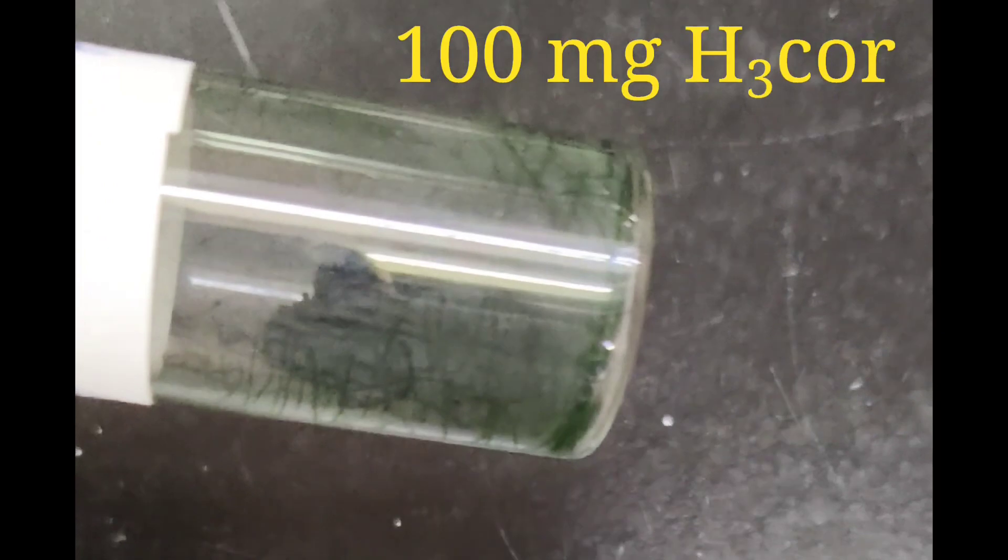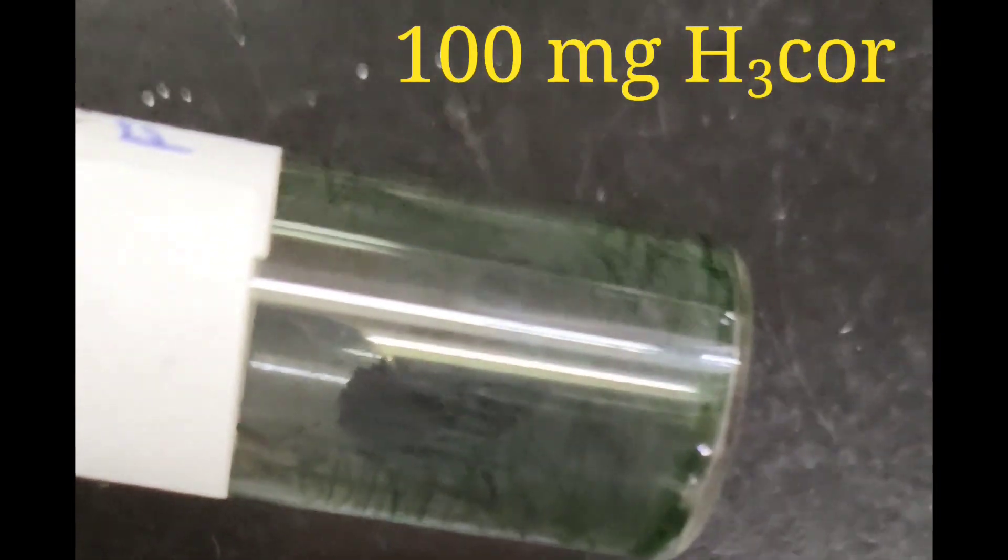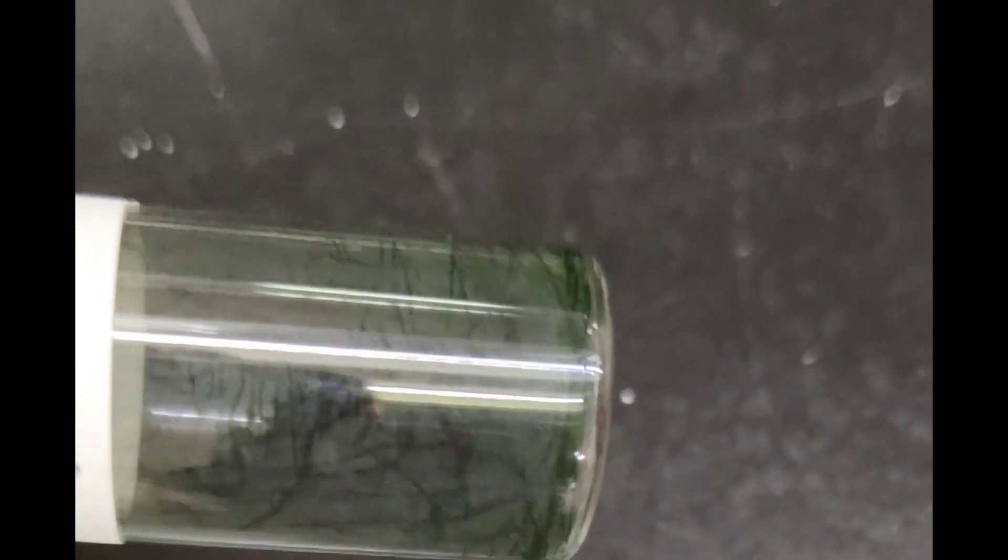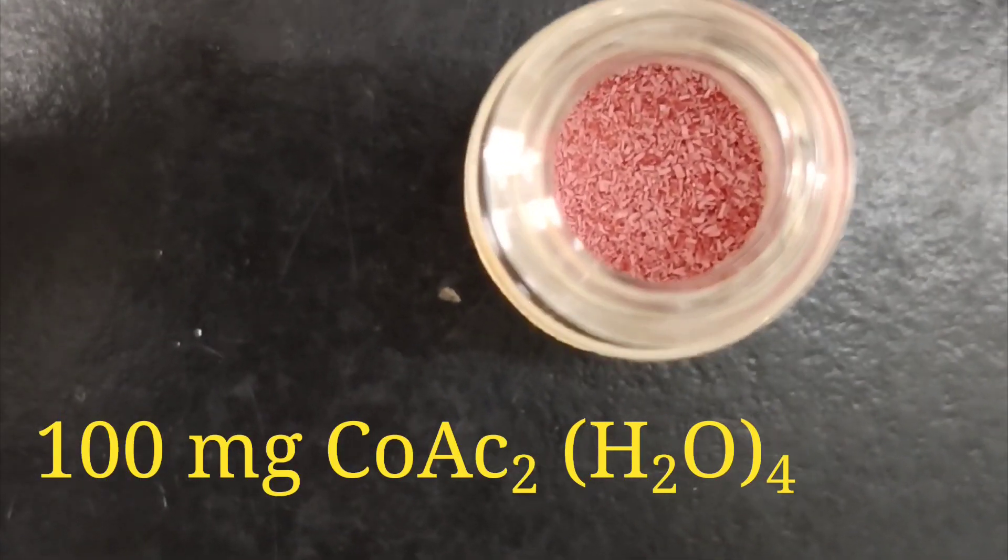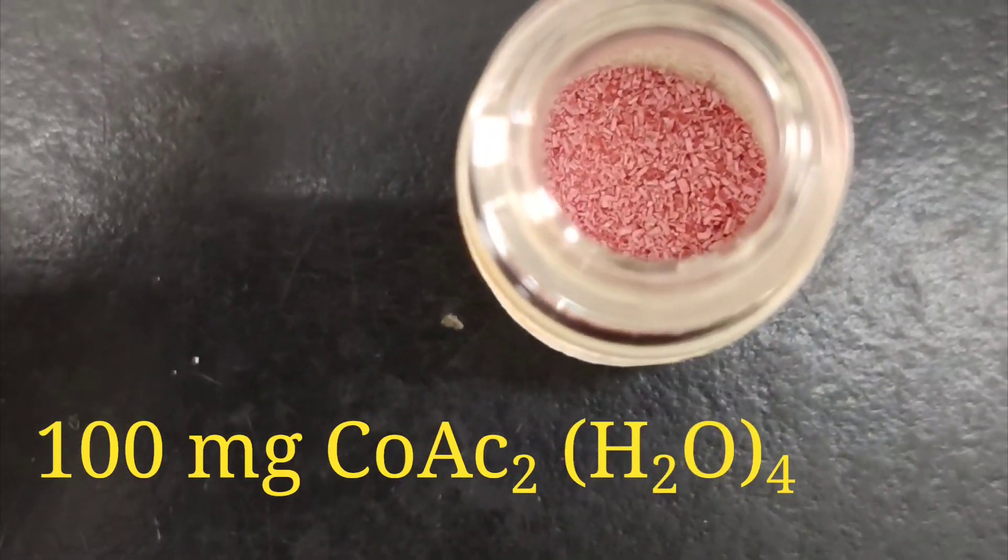First we weigh 100 milligrams of the freebase corrole which can be seen in this vial. We also weigh 100 milligrams of cobalt acetate tetrahydrate which is around a 2.5 molar excess.